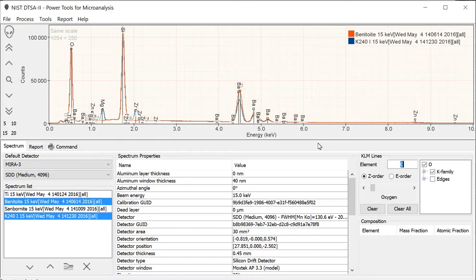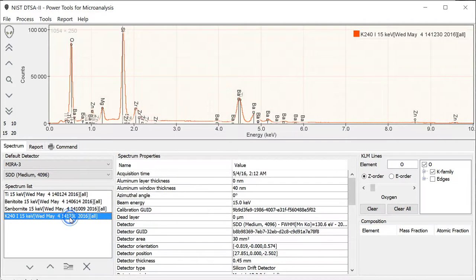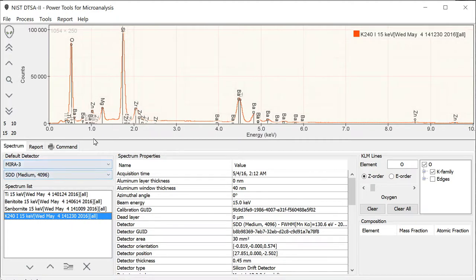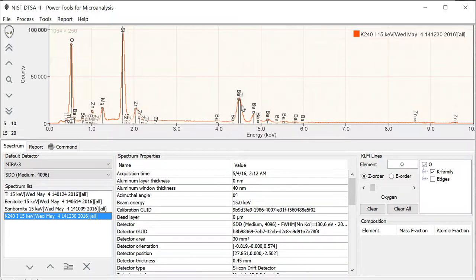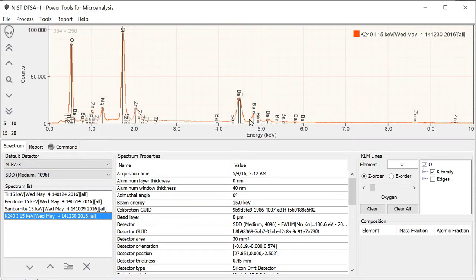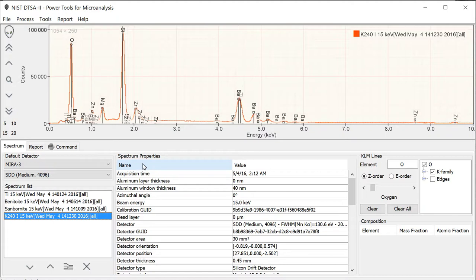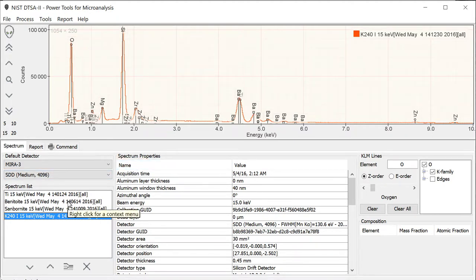Often you want to quantify a material like K240, which is a complex glass containing a number of different elements. We're going to focus on the barium and titanium because they have a particularly nasty overlap in this region. A good strategy when you're quantifying a spectrum is to choose a standard that's similar in composition to the unknown, because this way we minimize the size of the matrix corrections which need to be applied to actually determine the composition.